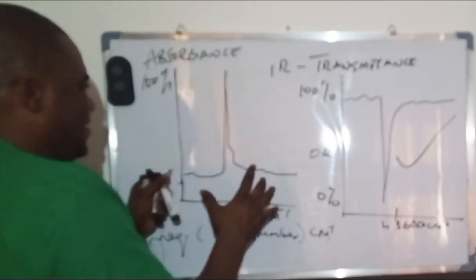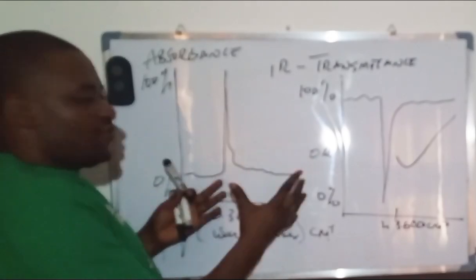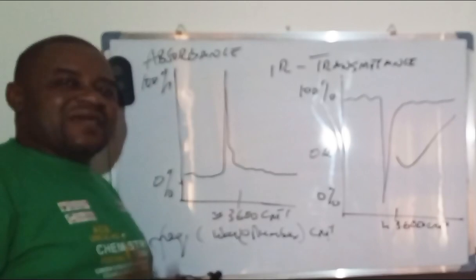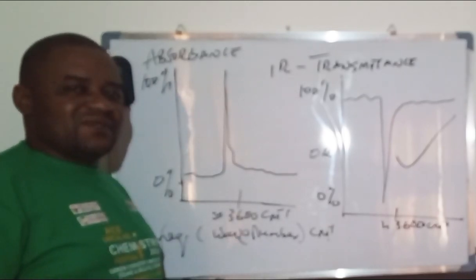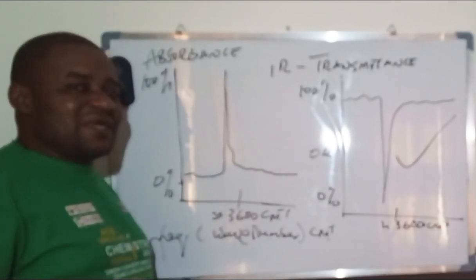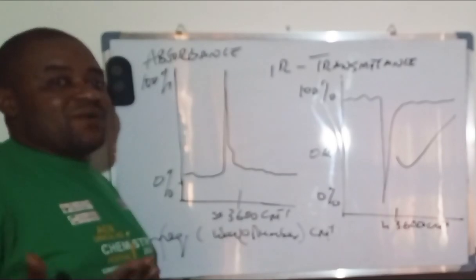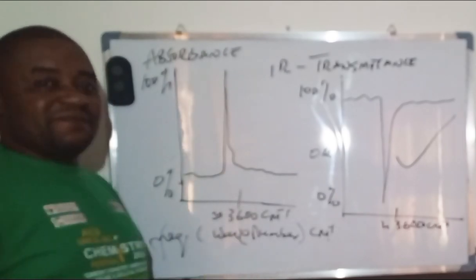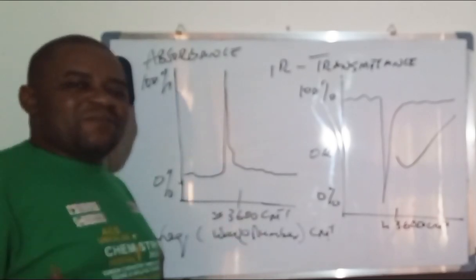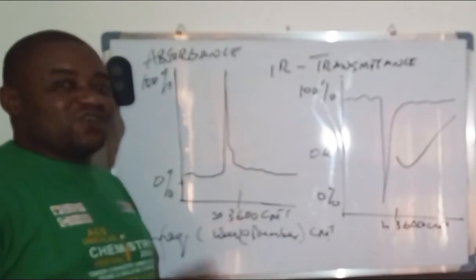Now, having gotten here, we also need to know that where your display unit is displaying this IR transmittance spectrum, there are different types of spectra. The spectra that you get can be strong, medium, or weak. It depends on the intensity of the bands, and that's why we are saying that not all the covalent bonds a compound has are able to show in the IR spectrum.